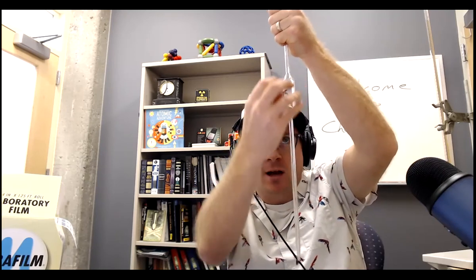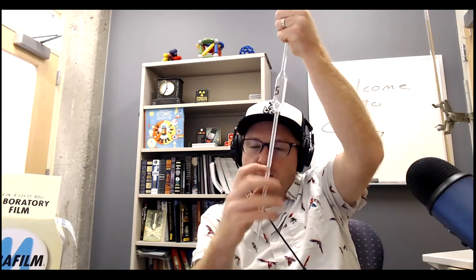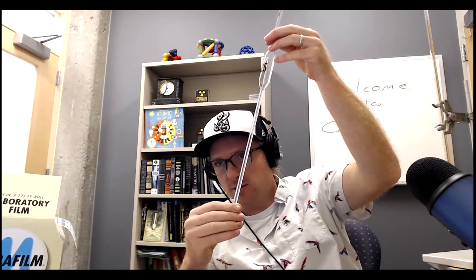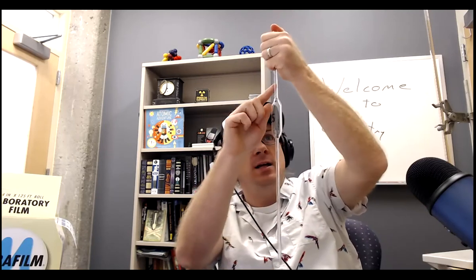Then you've got to look in here and make sure there are no air bubbles. If there's an air bubble here, bad news, you've got to start over. You've got to drain, get that air bubble out, and fill it back up. It has to be no air bubbles here. Get your thumb on it, right at the meniscus, no air bubbles.